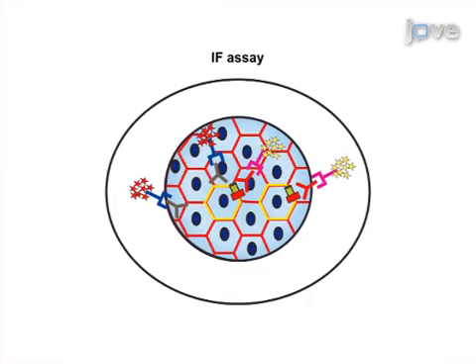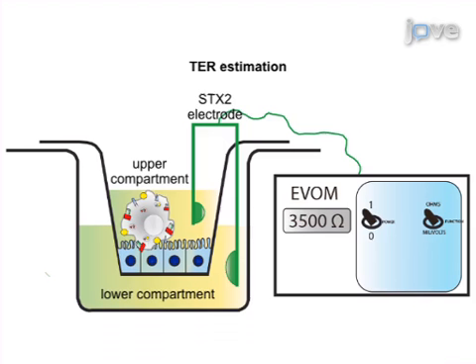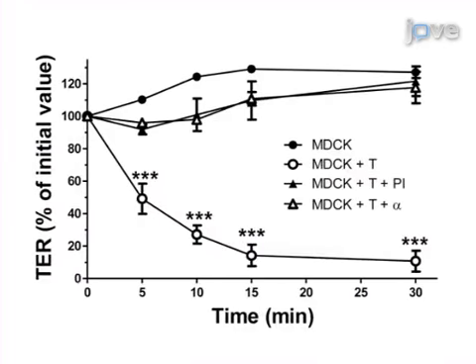Now, using immunofluorescence, analyze the treated epithelial cultures for select Entamoeba histolytica proteins that interact with tight junctions of the epithelial cells. Also measure alterations of the paracellular barrier by transepithelial electrical resistance. Taken together, results can demonstrate tight junction disassembly by Entamoeba histolytica and also pinpoint the participation of the select complexes in this process.